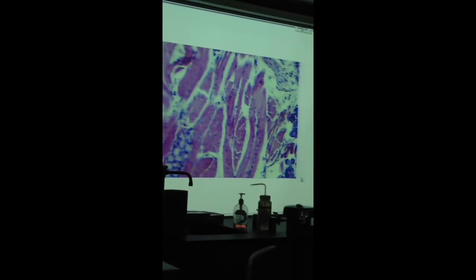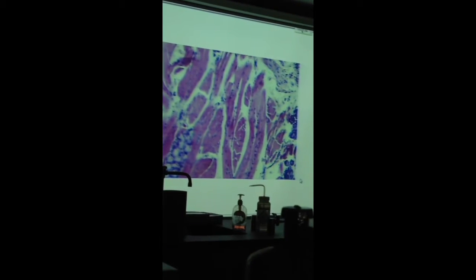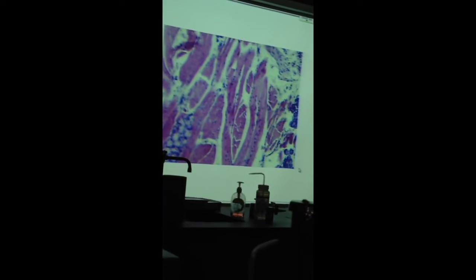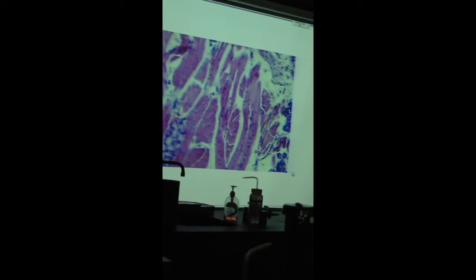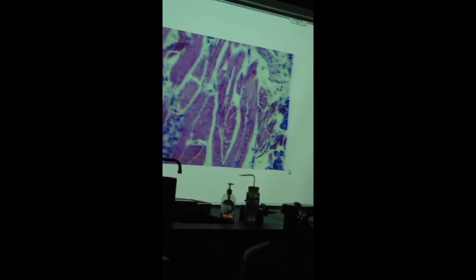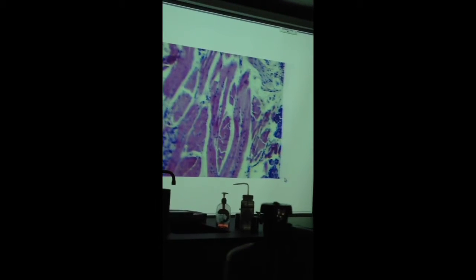What kind of muscle would this be? Skeletal, honestly. It's under conscious control. You can manipulate the tongue. Some people can do very fancy things with their tongue, you know, bar tricks. They can take a cherry stem and tie knots. But it's highly manipulative because of all these skeletal muscle fibers here. So that's what this is. It's muscle, but not smooth muscle. Skeletal muscle.